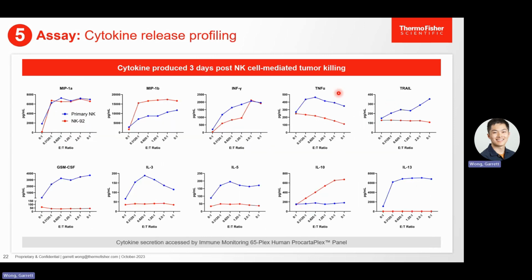Once the time-lapse imaging was complete, the supernatant was collected to be used in the cytokine release profiling assay. In this case, we used the 65-plex ProcartaPlex panel. And right here, we have some of the cytokines that are highlighted that are all important for NK-mediated immune response.